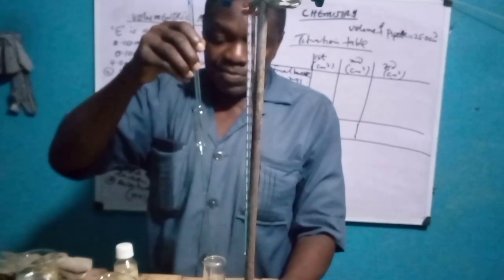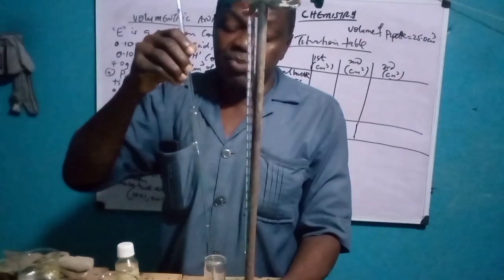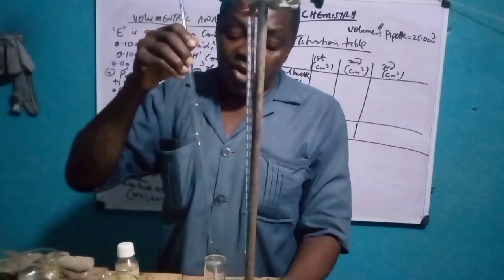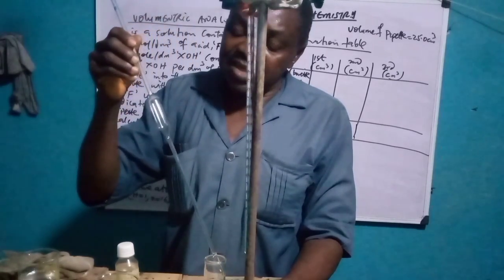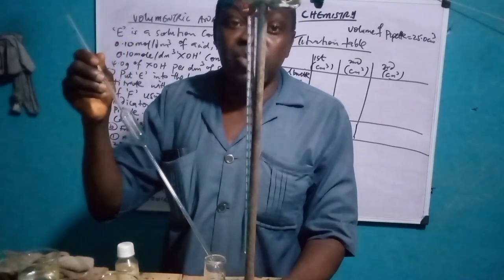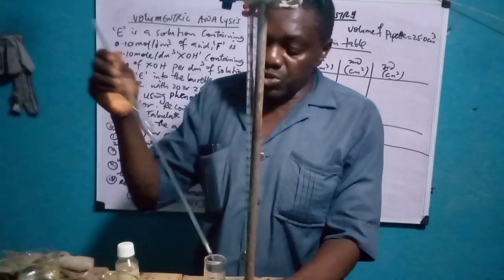It's still draining. You have to be patient. And remember, another precaution, you must not blow the last drop with your mouth, because the manufacturer, as I told you in the first video, has already constructed this thing in such a way that there's always a last drop. They may ask you, why must you not blow the last drop? Any attempt to blow the last drop will increase the volume. So you don't do that.